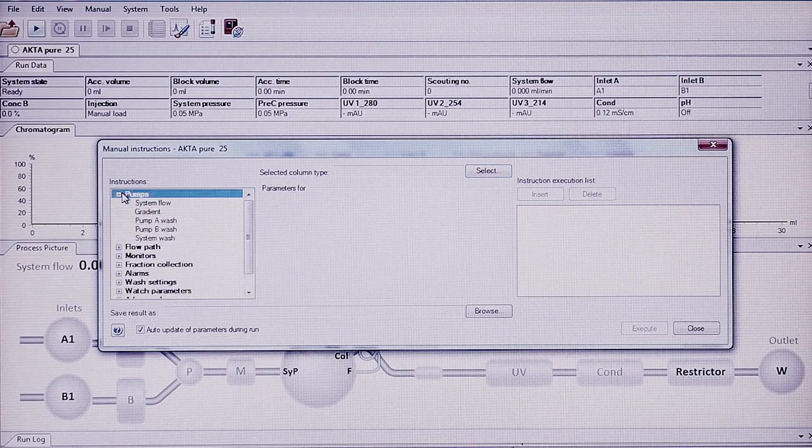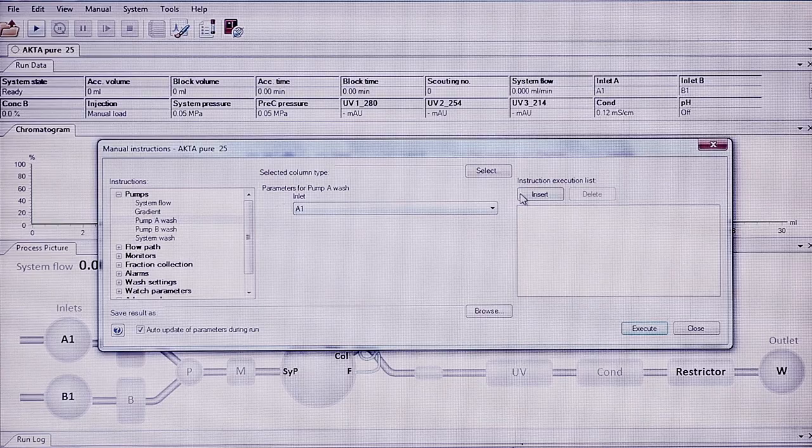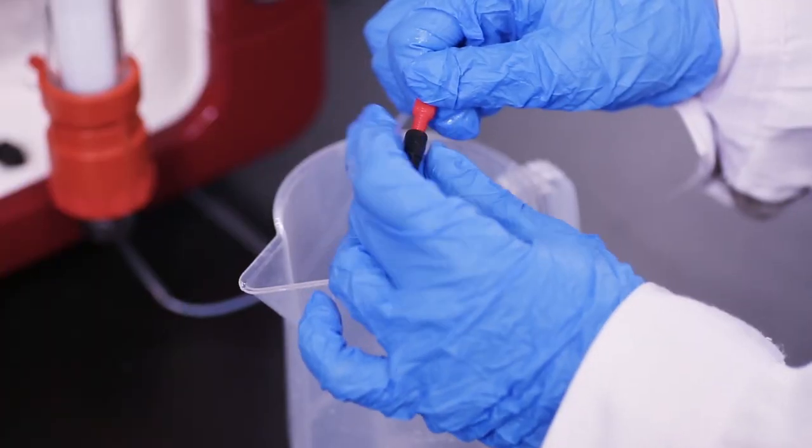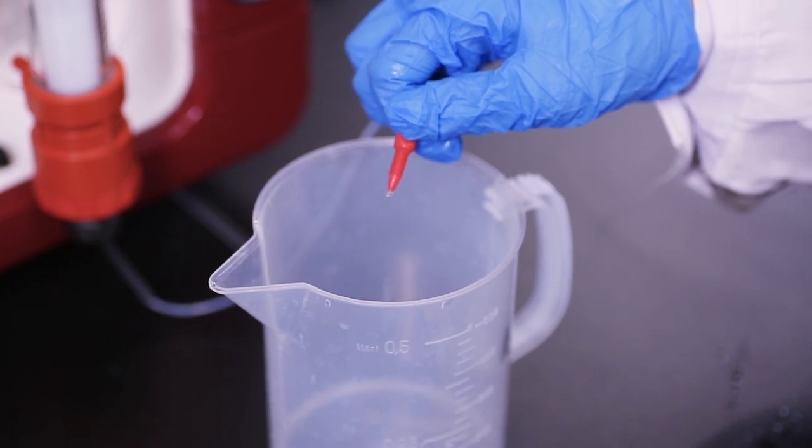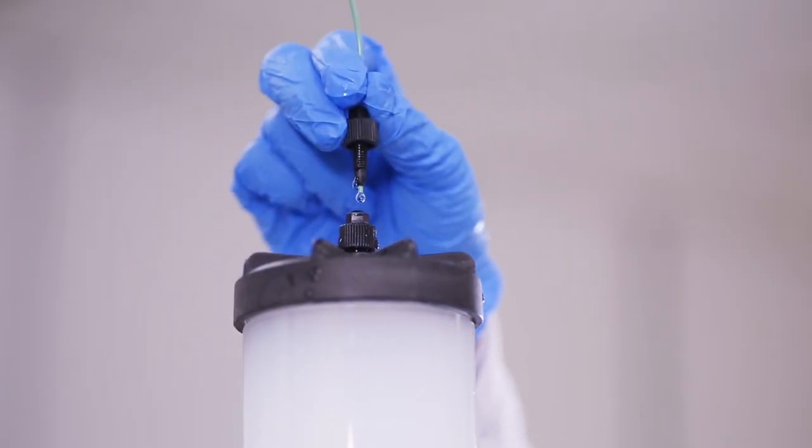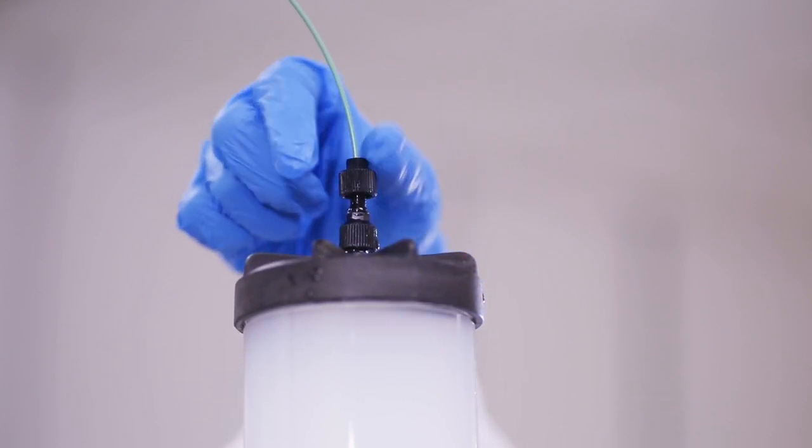Use the pump wash function in Unicorn to remove unwanted air in the system or tubing. Place a beaker for waste under the column and remove the stop plug at the end of the column. Start the pump and attach the tube to the top of the reservoir at low flow rate with a drop-to-drop connection.